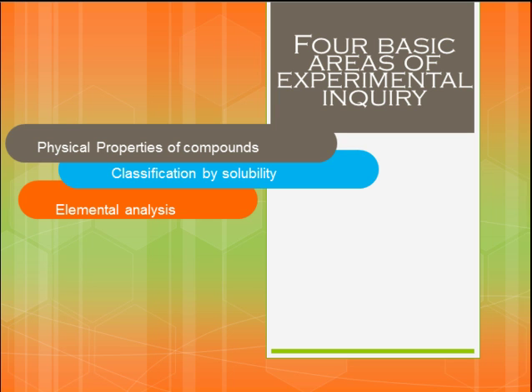The idea behind it is that when an organic compound is fused with sodium, any halogens, nitrogen, and sulfur will be converted into their respective inorganic sodium salts.